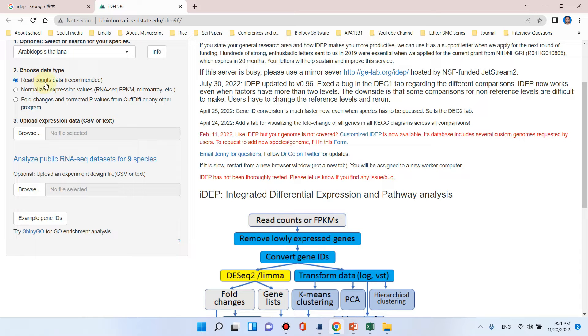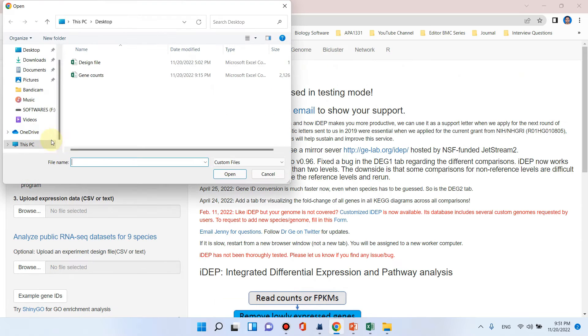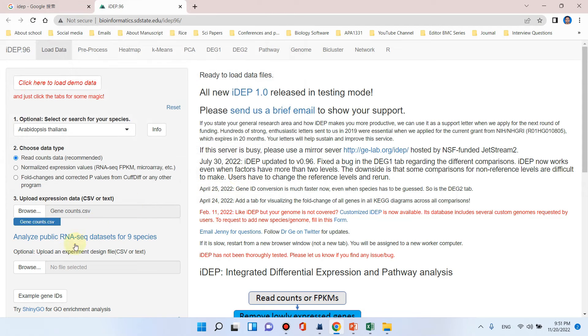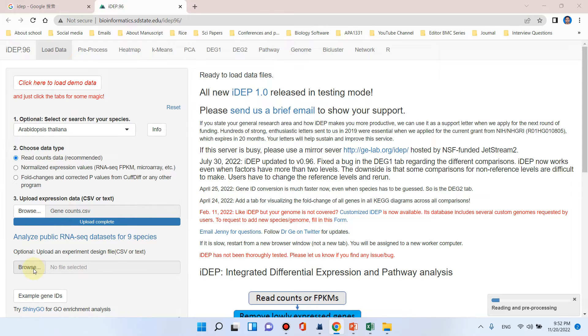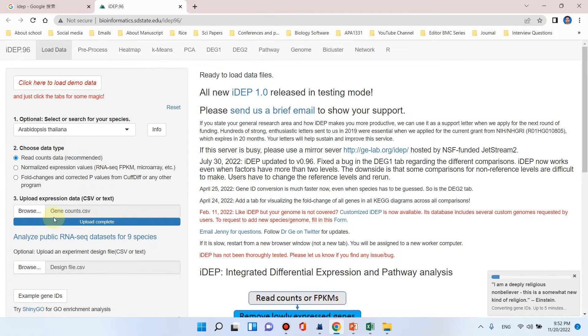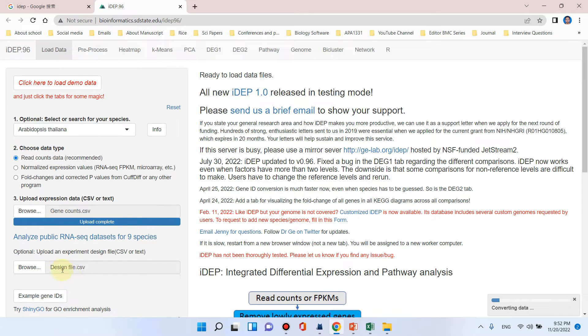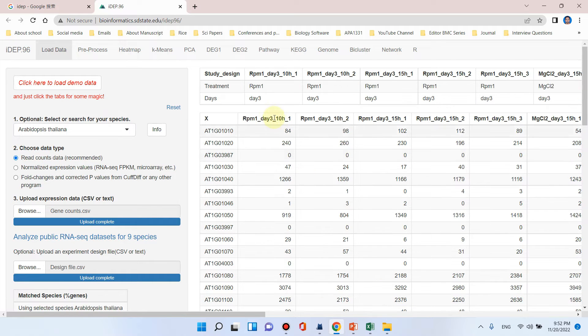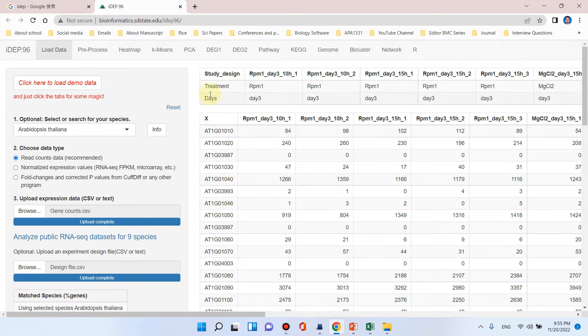Because we are using read counts data, I will use gene counts data. You can see here the gene counts file, I will simply click on open. Here we need to upload our design file so we can go browse and select our design file. Our gene counts and design file have been selected and it is now converting the data. The upload is completed and study design and gene read counts data is uploaded.